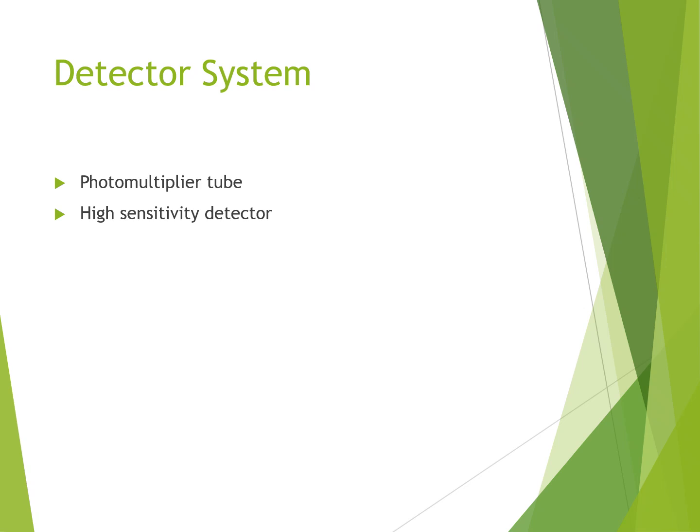They can detect very weak fluorescence signals and can measure very low concentrations. So they are very sensitive detectors.